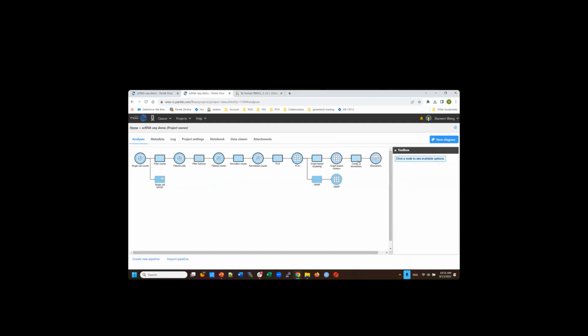That's why you see the compute biomarkers, and the result will tell you, cluster 1 compared to non-cluster 1, those are the top genes upregulated. It almost tells you those are the positive biomarkers. And whether you agree with it, you have to verify. So this is, as a biologist, your job to do the identification.